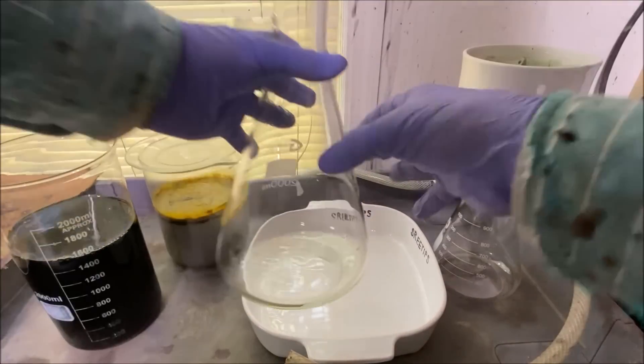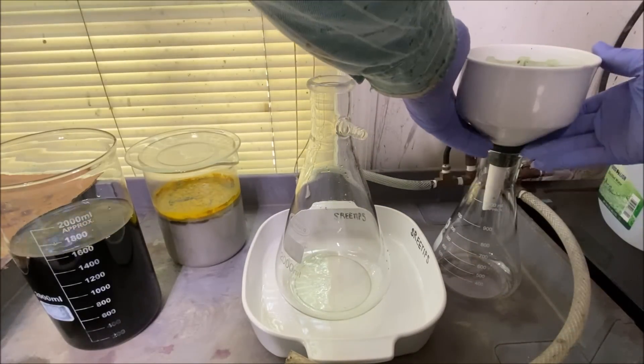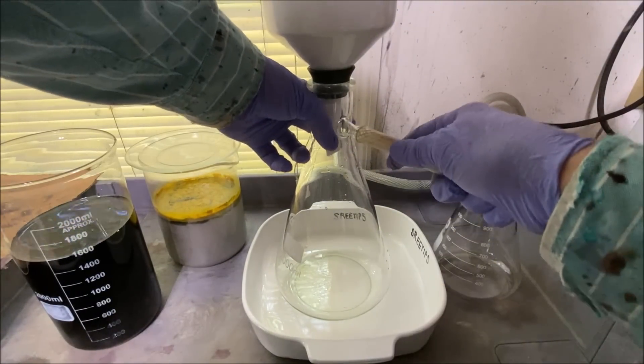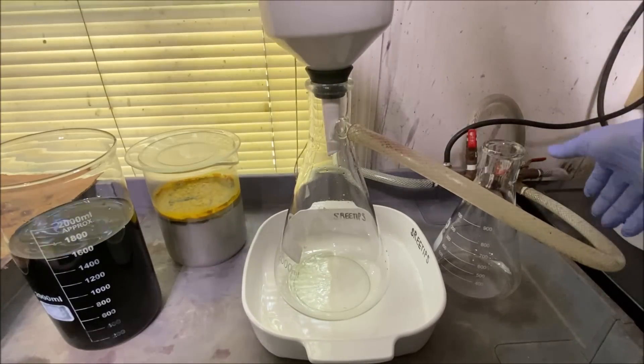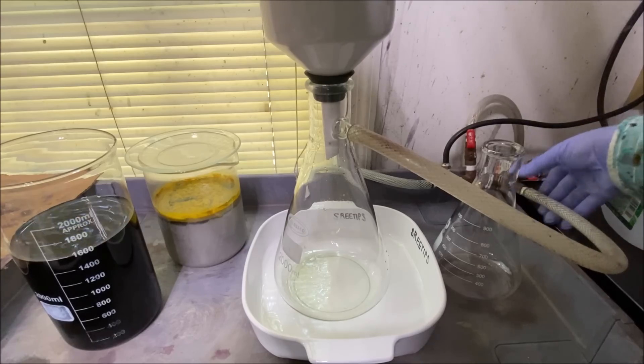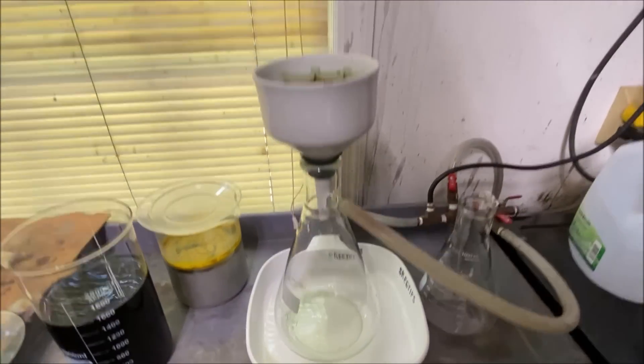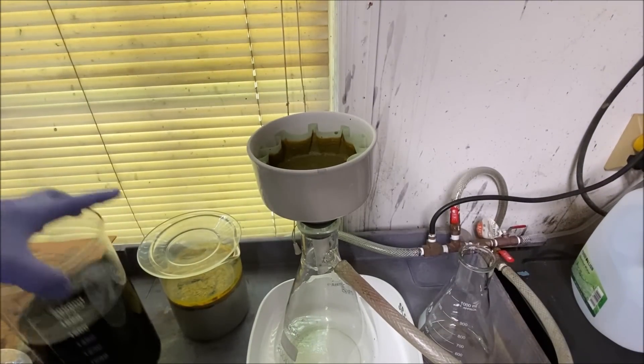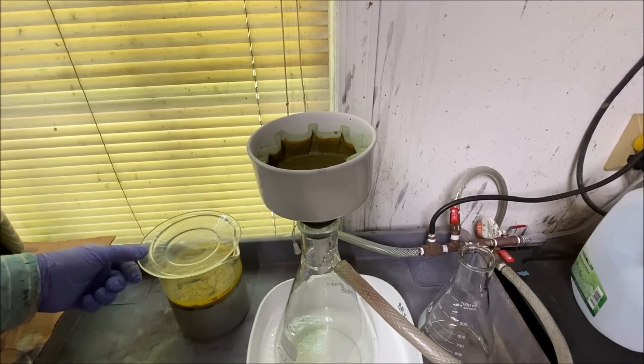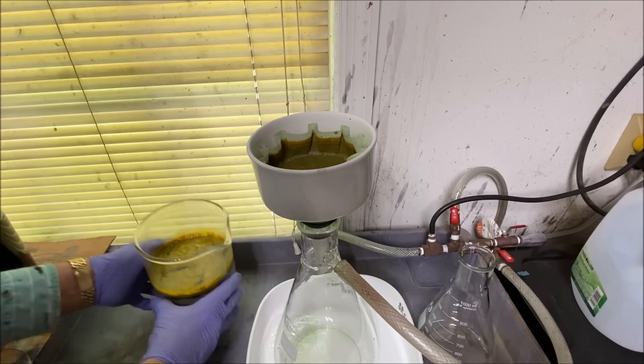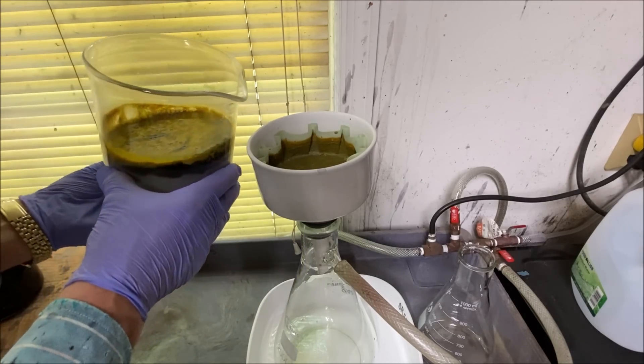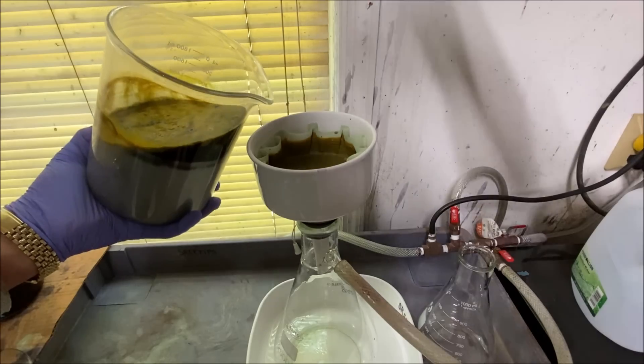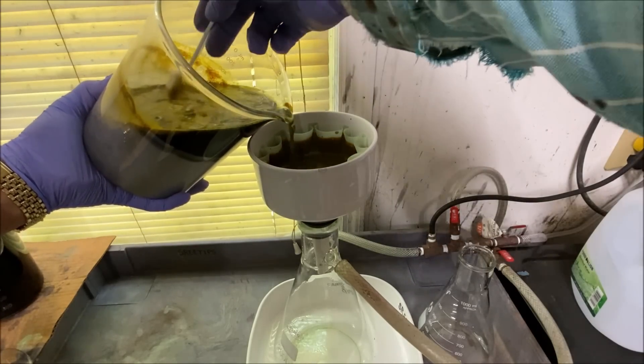Now we'll put the filter back in the funnel, turn the vacuum on. Now we'll continue filtering this solution. Try to capture it in this filter. This is our dmg precipitate from the second beaker.